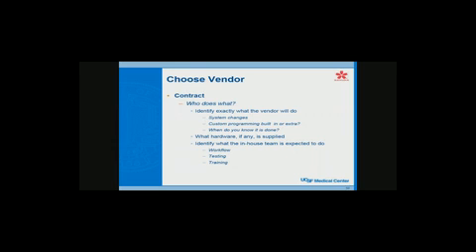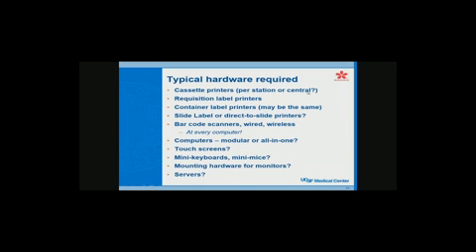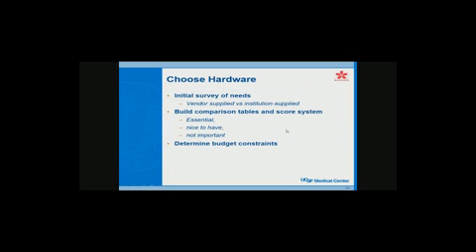What hardware is supplied, what they're going to do, if they can specify hardware, if they're not supplying it. In other words, they may have tested certain hardware that they know works and that they would like you to use. And then you have to identify an in-house team, both the vendor, your in-house people, any other vendors like for equipment that are going to test workflow, test the equipment, and train people. So this is an example of a simple contract. I took out all the prices on it. I don't think they want me to show the prices we paid, but it just kind of gives you an idea of the different types of things that are on the contract and what it's lined out for.